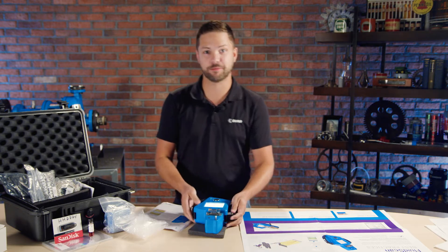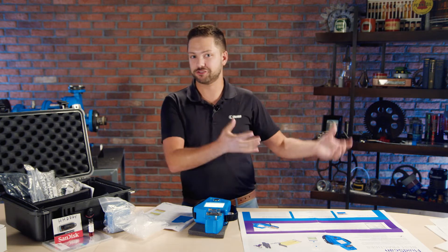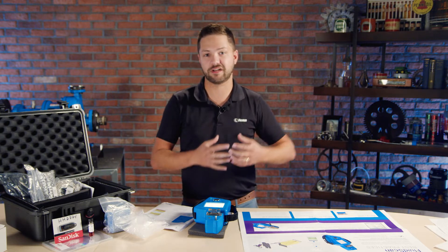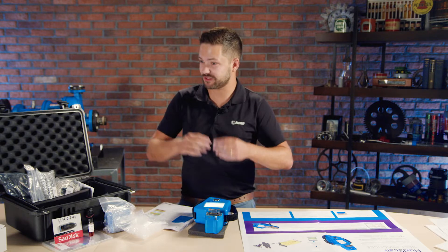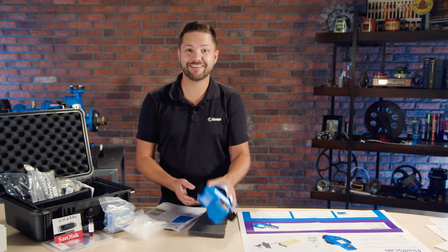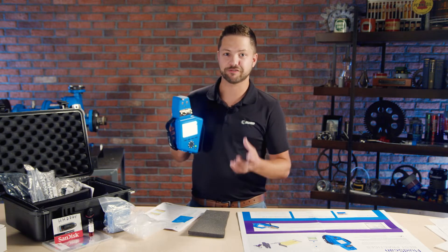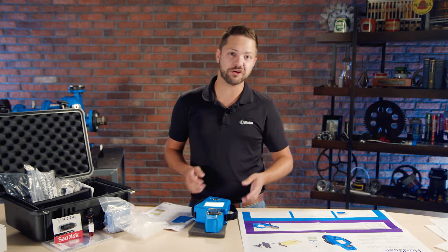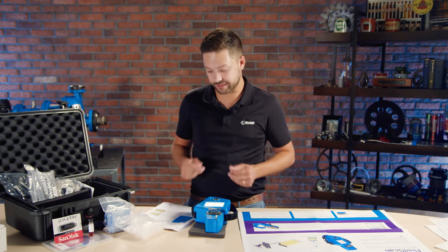You might be familiar with some of the larger instruments you see in the laboratory, including Fourier transform infrared spectroscopy — FTIR. It's more complex and there's a lot of big equipment involved in producing those results along with all the other instruments in the laboratory — it can be quite sophisticated. Well, this gives you the ability to perform that similar type of analysis and characterize your lubricant right at your plant, whether at your desk or even going around doing certain types of routes. All those capabilities are right here.